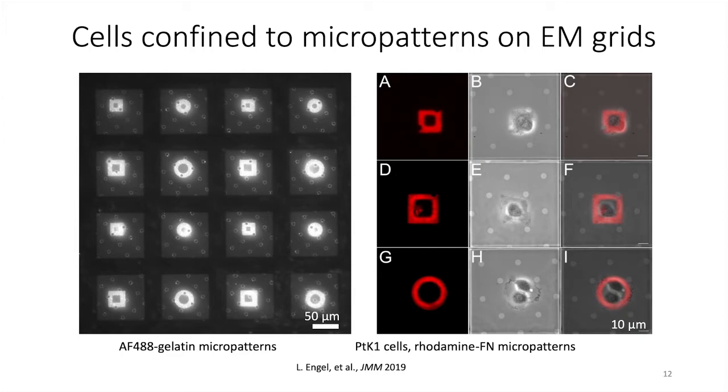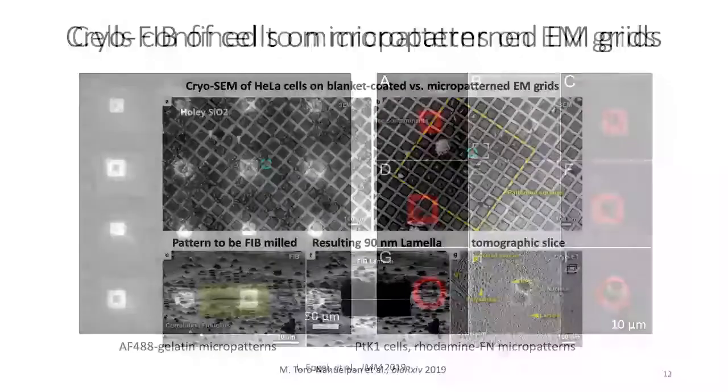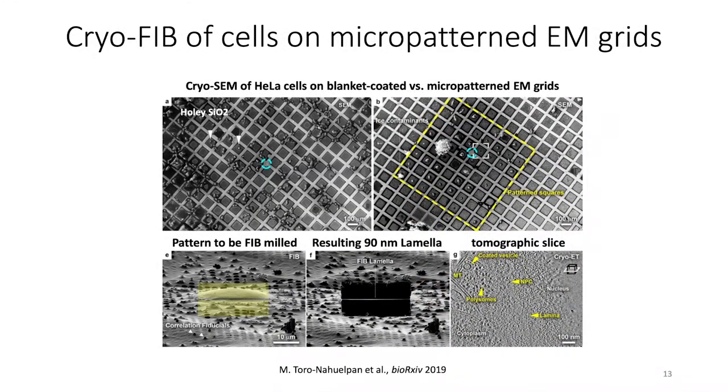This is an exciting result for reasons beyond the mechanobiology that motivated our study. It turns out that positioning cells on grids is extremely helpful for getting the most out of your grids when performing cryo-ET. We believe that maskless photopatterning can increase the success rate of cryo-ET data acquisition through positioning cells and specific areas of interest of cells at favorable imaging positions.